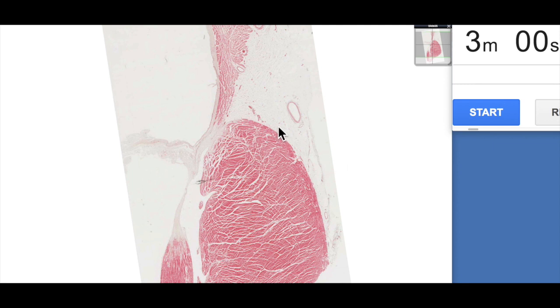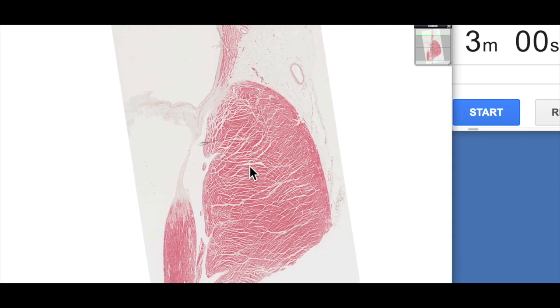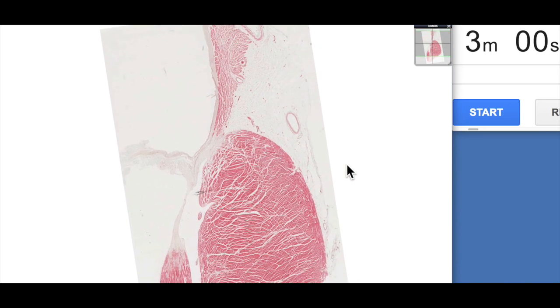I love this section actually because it's a junction between the atrium, the ventricle here and then we've got an atrioventricular valve with its attached papillary muscle and chordae tendinae. I've sort of jumped the queue there so we'll have a look at these features in our three minutes.